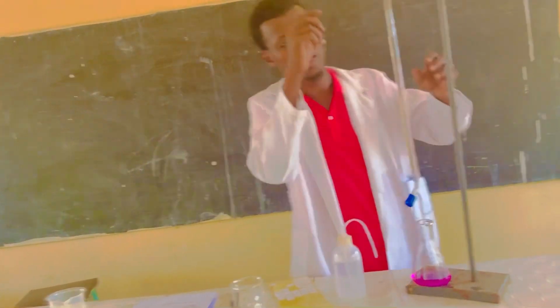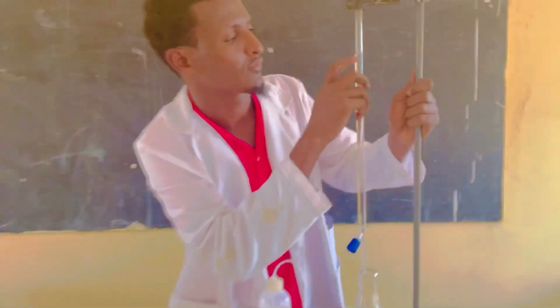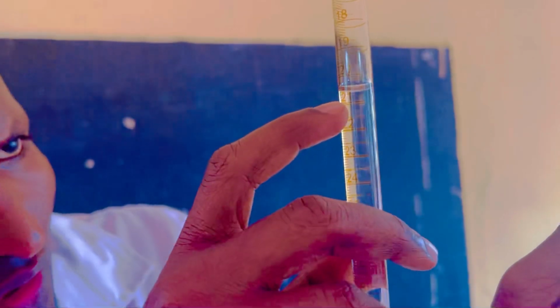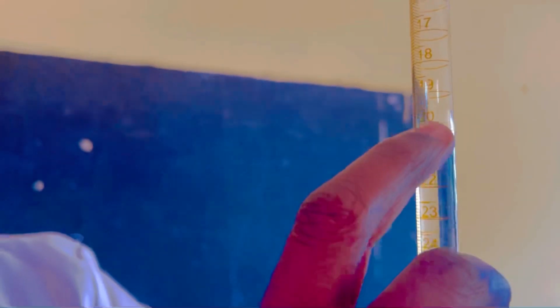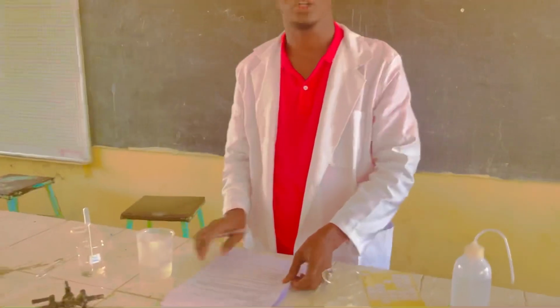So I'm going to read the values now. You read the values from here. So my first titer is 20.4.